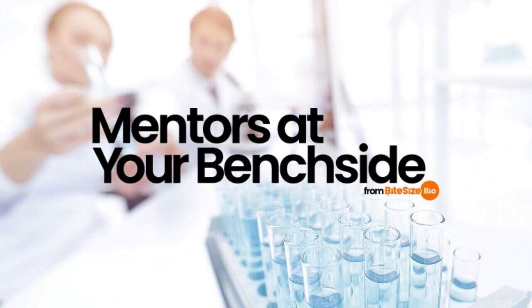Fluorescence microscopy images not only look great, but also allow us to get a better understanding of cells, structures and tissues. It's a tool for discovery. And with confocal laser scanning microscopy, we can discover even more. It combines high-resolution optical imaging with depth selectivity, which allows us to do optical sectioning. This means that we can view visual sections of tiny structures that would be difficult to physically section, like embryos for example, and construct 3D structures from 2D micrographs.